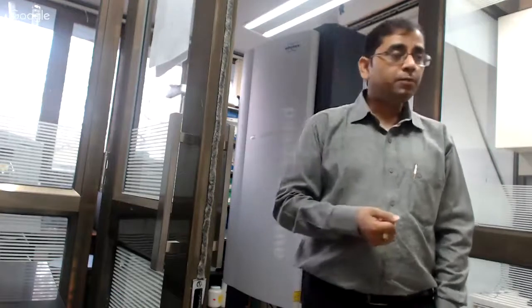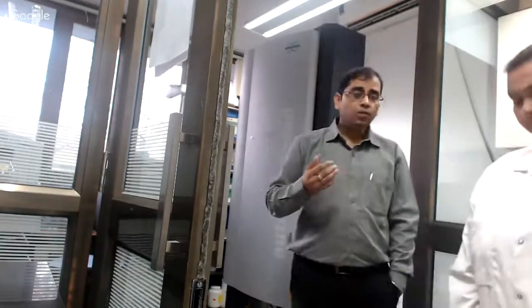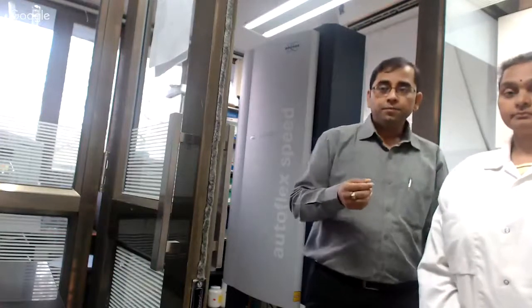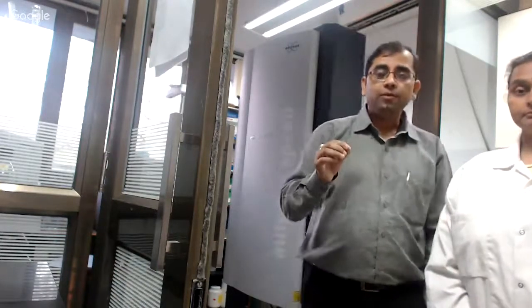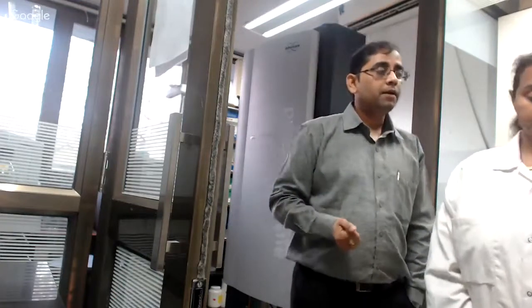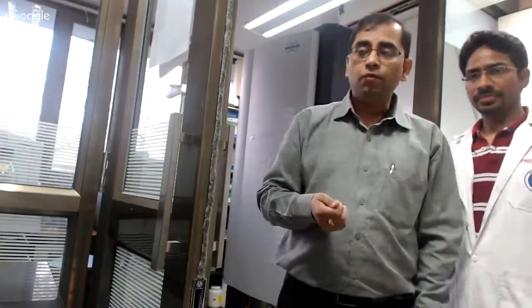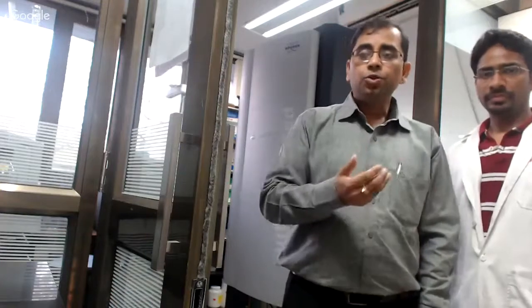So let me introduce one of the research associates with me, Dr. Aishwarya Rao. Dr. Aishwarya Rao is an application scientist. She is working on handling Maldi TOF based applications at IIT Bombay. She's going to talk to you in much more detail about some of the basics of Maldi TOF, and then she is going to walk you through one of the demonstration sessions. I also have with me a teaching assistant. Please come here. He's Mr. Vipin. He's a senior PhD student. He is pretty much involved in this course as the official TA for the course. He's going to show you the hands-on part of how to prepare the samples.